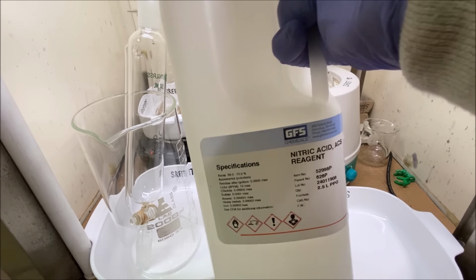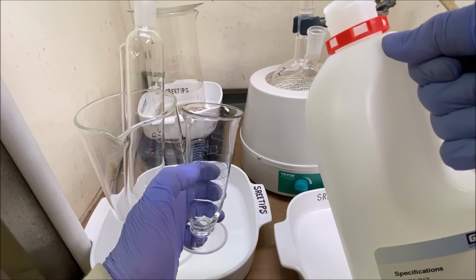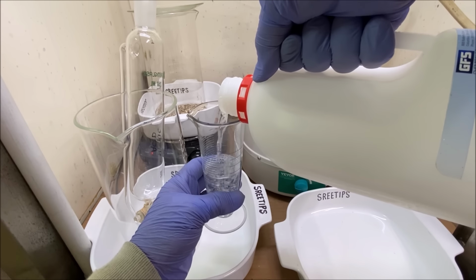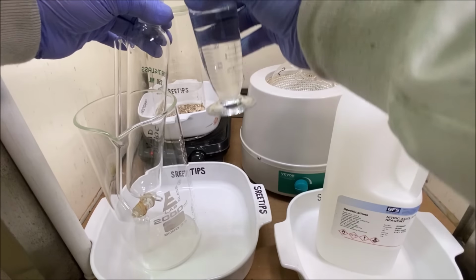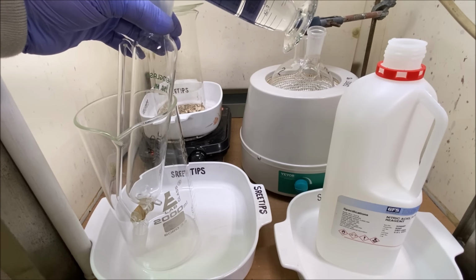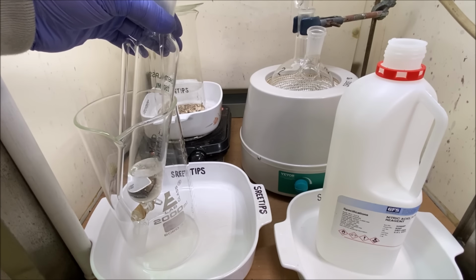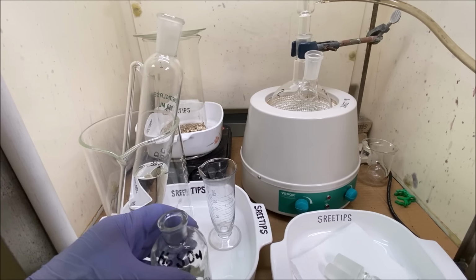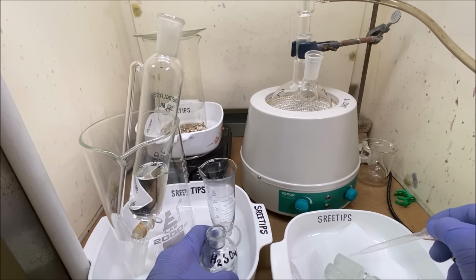Add some nitric acid now. We're gonna start out with 100 milliliters. Right there is 100. Here we go. Charge our funnel up with 100 milliliters of nitric acid. Go ahead and get some sulfuric acid on these plugs, just a couple drops, enough to create a seal on these ground glass joints.